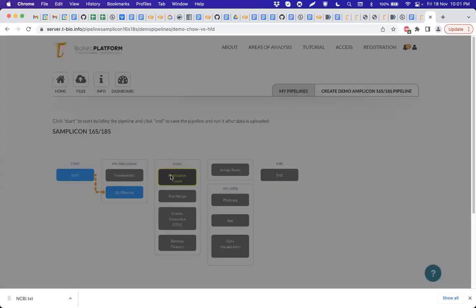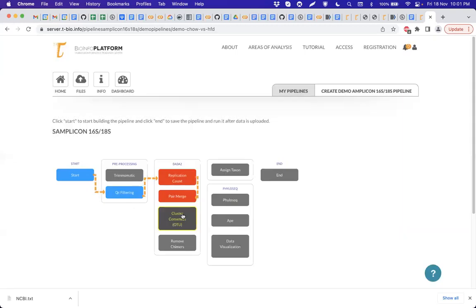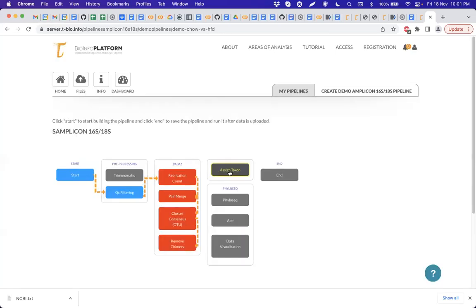And I will quickly open this up and show you where the error plots are that we did not get access to in the previous sessions. And then we will use the same input and set up a QIIME analysis.